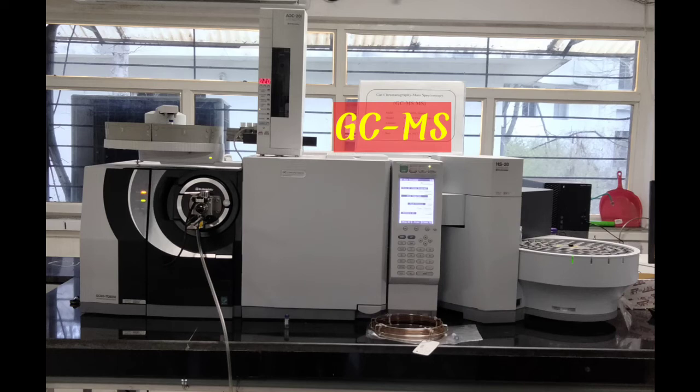GC means gas chromatography and MS means mass spectroscopy. The GC works on the principle that a mixture will separate into individual substances when heated. The heated gases are carried through a column with an inert gas. As the separated substances emerge from the column opening, they flow into the mass spectroscopy.